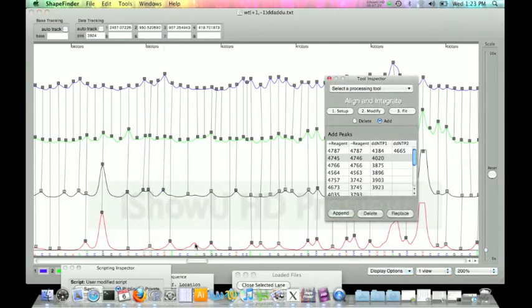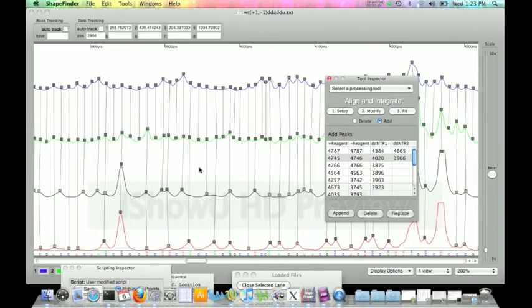Our A lines up with our A's. And that's most important. Even though these peaks might not be peaks themselves, the fact that this data point is over this ladder and that it's lining up with the sequence is the most important part, because that's the only way you can guarantee that that nucleotide is lined up with the right value of the ladder and the right shape reactivity. So we're going to go ahead and keep going.